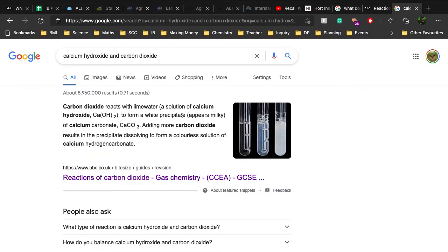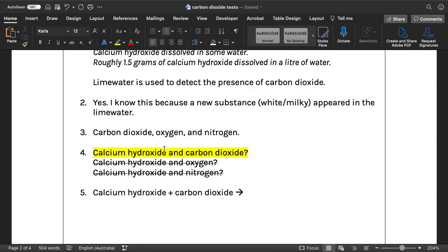Yes, sir. Yes, it is. Yep, so the solid that doesn't dissolve is what a precipitate is. That's a technical science jargony word for that. Yes, sir. Well, you could. You just have to wait for a while. If you gave it a day, then you'll see it.